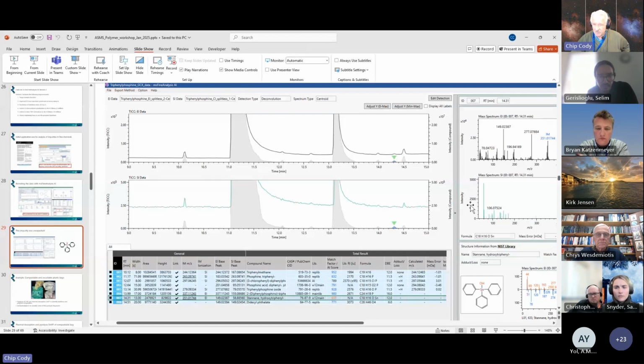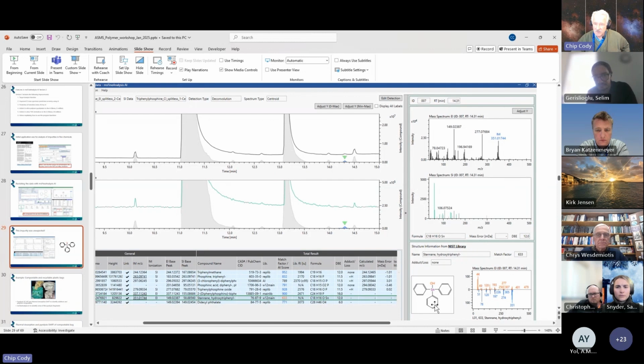If you want to, and I've pulled over the side window, you can see over here the detailed information for this compound. This one actually did turn out to be in one of the databases. But if you double click on each of those lines, then you get all of the other tabs that you can examine in detail. And I have to admit, I go through and check these interactively. I'll check to see whether I agree with the assignment of the molecular ion, for example, or if I'm in CI, whether it's chosen an adduct or a protonated molecule, or which peak it's assigning as the protonated molecule.